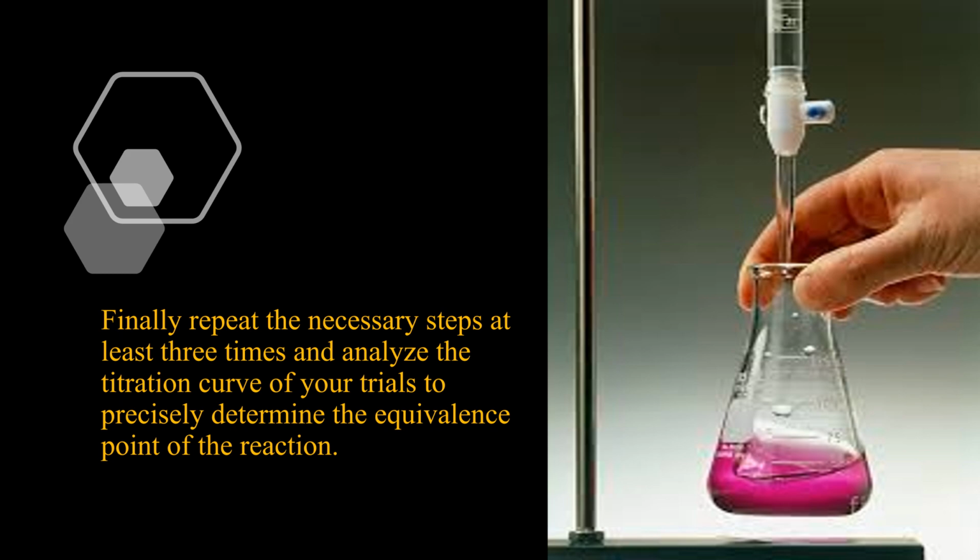Finally, repeat the necessary steps at least 3 times and analyze the titration curve of your trials to precisely determine the equivalence point of the reaction.